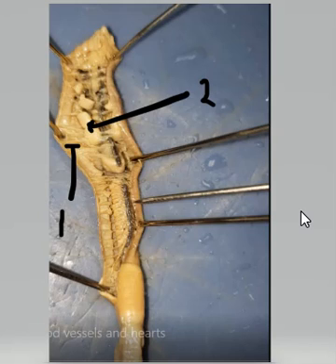This is Brother Barnes. Let's do an Earthworm mock practical to get ready for a quiz or test on the material. I want you to number 1 and 2 and tell me what you think about these features in the comments below, the identity of these features.